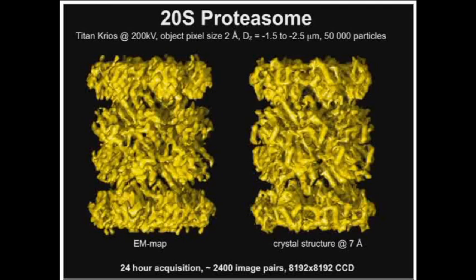Okay, the question why it's not helium temperature: it's another problematic issue added to the whole thing, because helium requires much more in terms of temperature stability than liquid nitrogen. In the Polara case, it was designed by Gatan, Oxford Instruments and Gatan. And in the Titan case, everything was done exclusively at FEI, and they don't really have the helium experience, so to speak. This was planned, and I guess it's only postponed; maybe they will come up with a new strategy and R&D in helium. But I guess at the moment they would like to have a reliable Titan first before they go into helium.